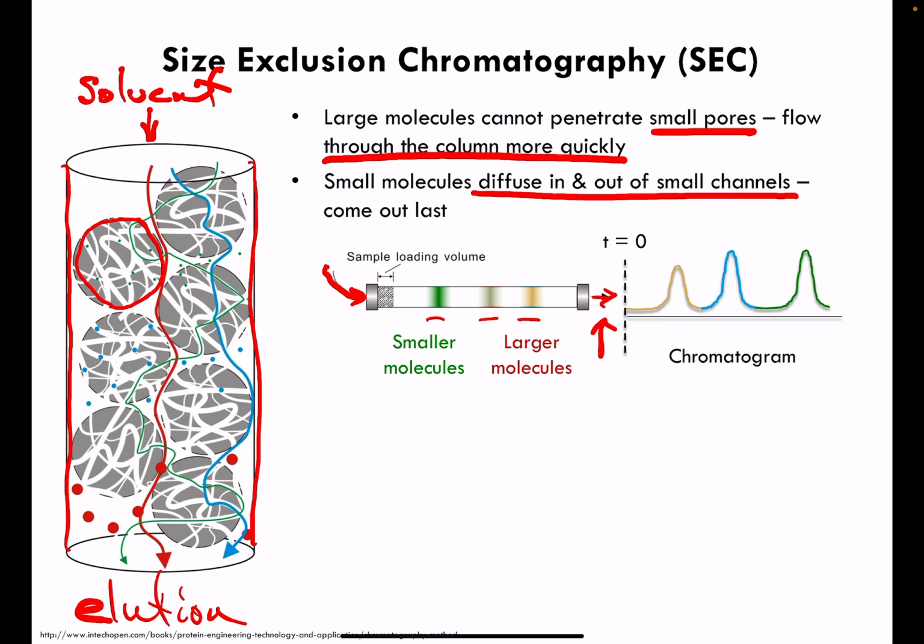If we think about the profile of how that detector would register the presence of molecules versus time, we might have the profile shown here. We can see here that the yellow population is eluting at the lowest amount of time, closest to the y-axis. So this would be what would be expected for the larger molecular weight molecules that are forced to just pass beside packing material and not associate with the internal pockets in that packing material.